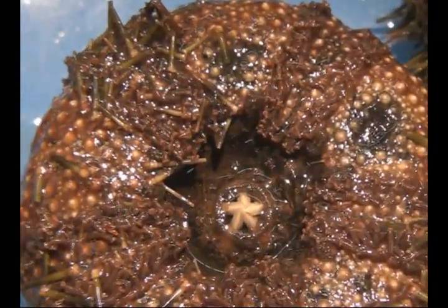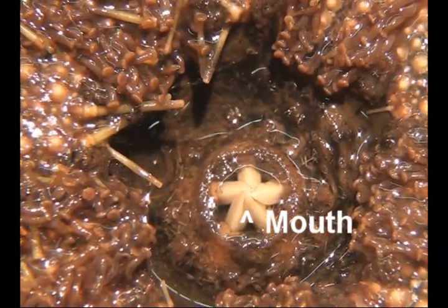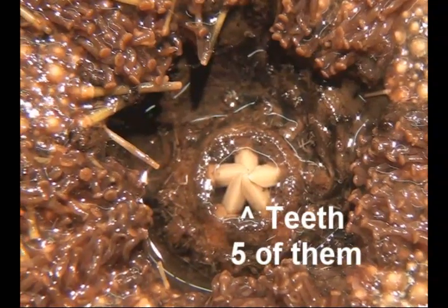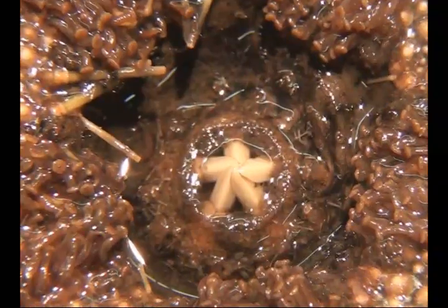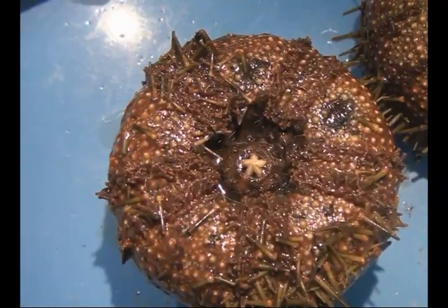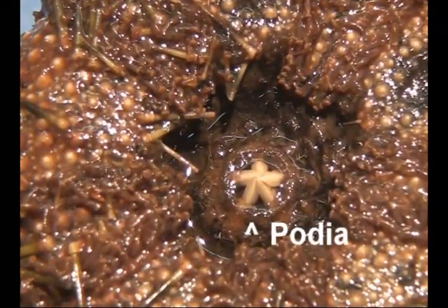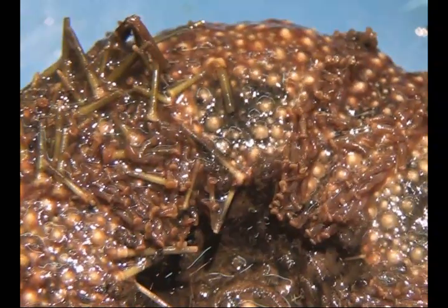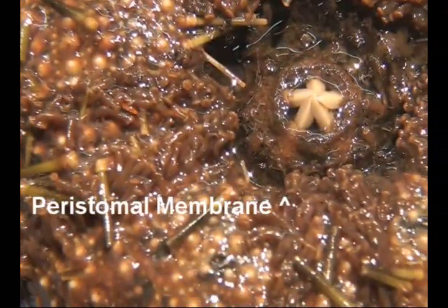Now let's take a look at the oral surface. Here we can see the mouth. Inside the mouth, we can see teeth — there are five of them. These ones are especially white; looks like somebody's been flossing. Around the mouth, we can see the podia, which is that fleshy ring thing. The area around the podia is known as a peristomal membrane.